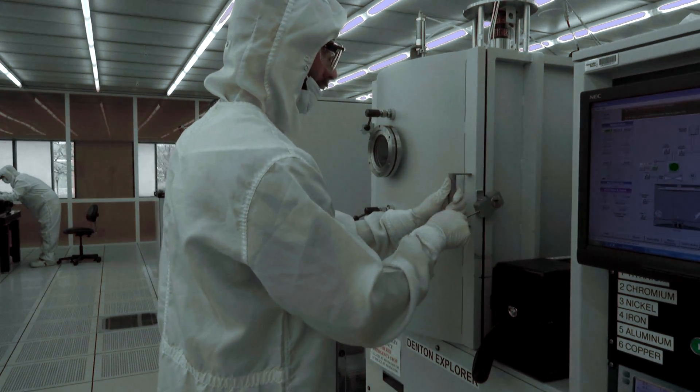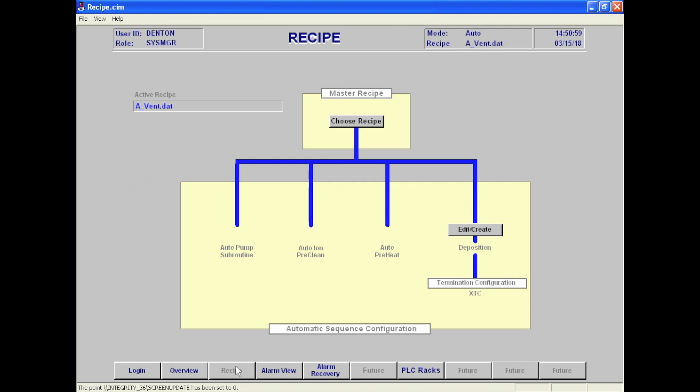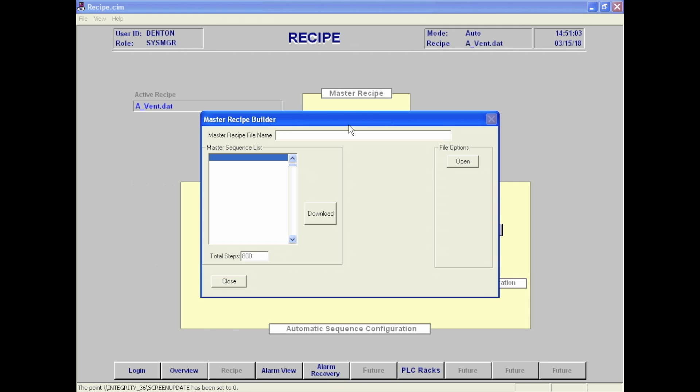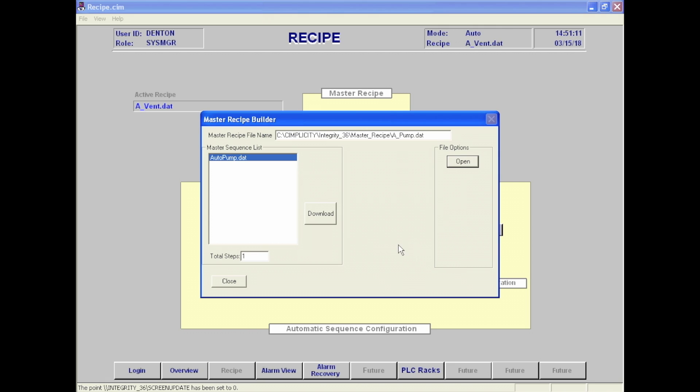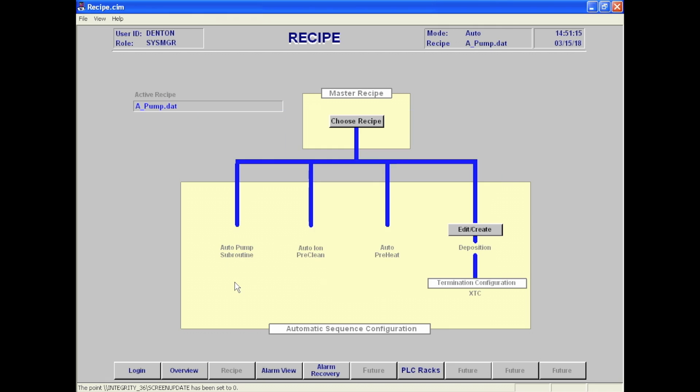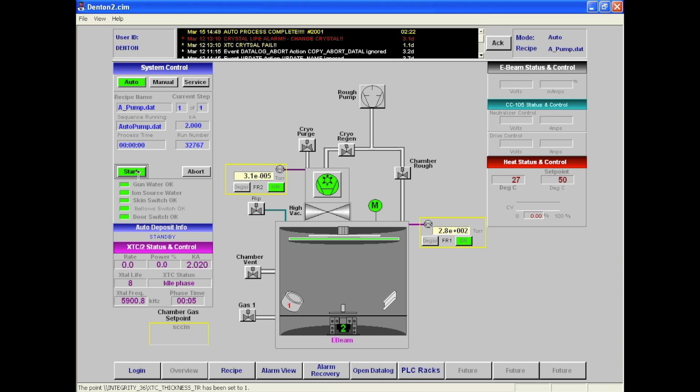To pump down the chamber, click recipe and then open under the file options. Select the recipe, apump.dat and hit open, download, and then close. When the pump process is over, a notice will appear at the top reading auto-process complete. The start button will also change from green to gray.